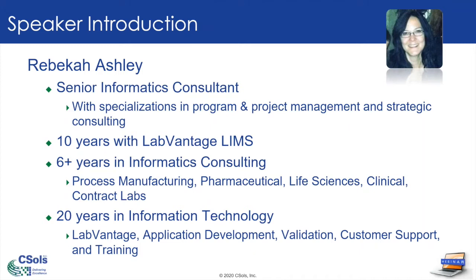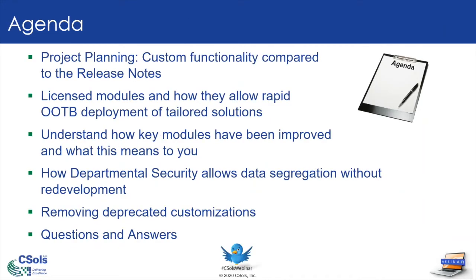I like how they approach the strategies and technologies to provide solutions and how they support clients moving forward, and that's what this webinar is all about. So I would like to go through discussing specifically approaching an upgrade for people who already have LabVantage and maybe on, in some cases, much older versions, and the different approaches you might want to take depending on what your upgrade is going to involve and how to identify that.